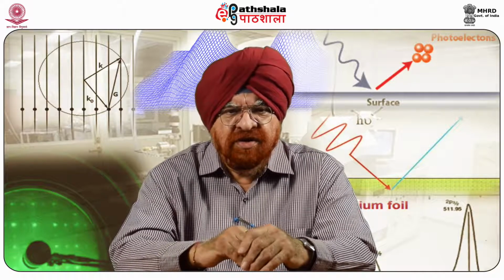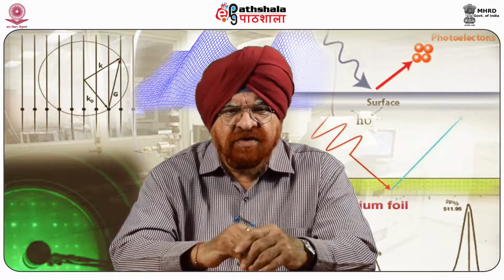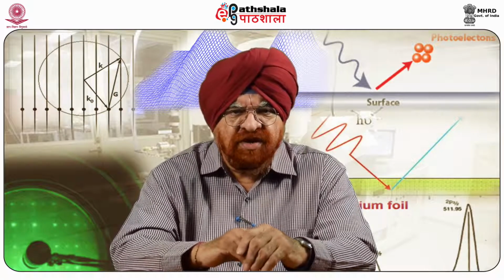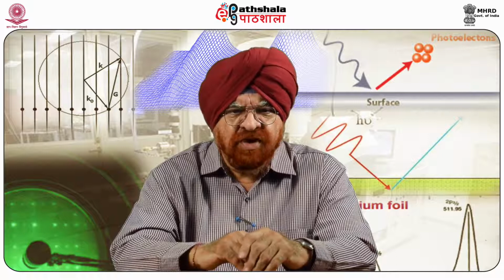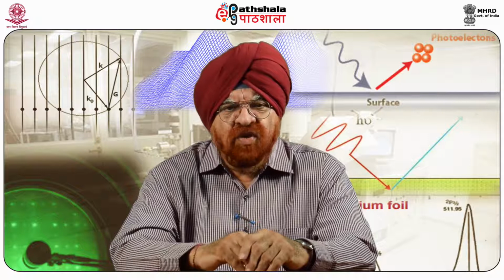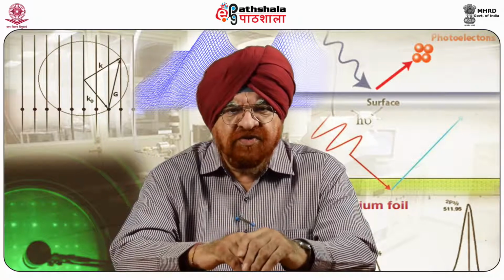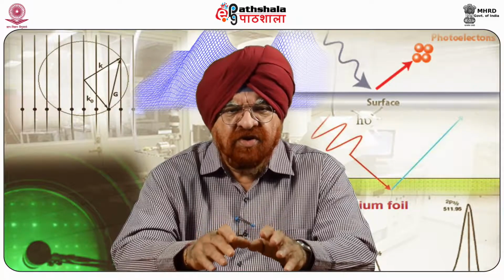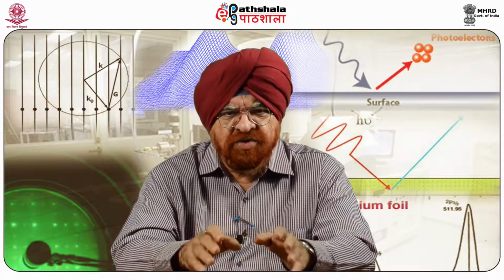MFM can image concurrently the magnetic stray field of the surface and topography with a resolution of about a few tens of nanometers.